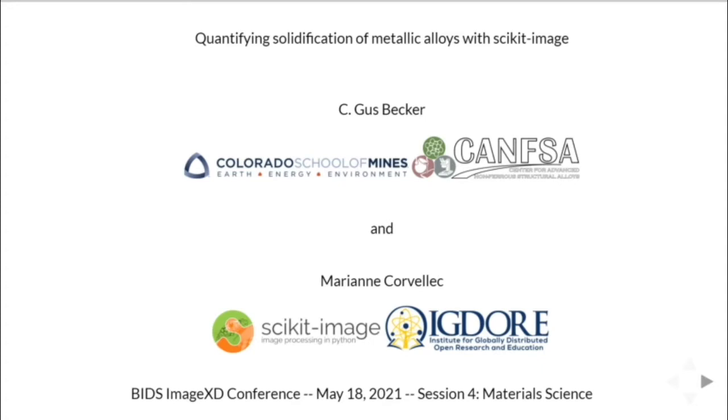This talk is about using scientific Python to analyze X-ray images of metallic alloys undergoing solidification. We are two speakers, so we want to take a minute to introduce ourselves, and then we'll dive into actual image analysis and material science.